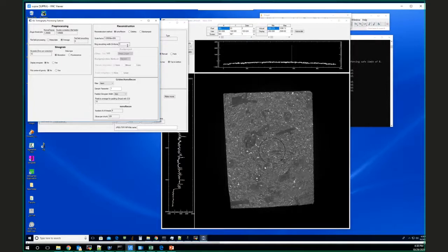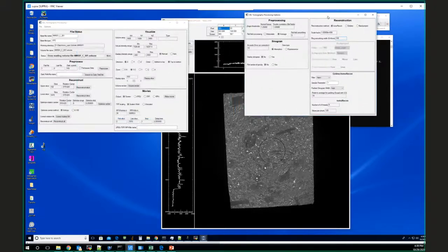So then I smooth that averaged sinogram and say anything that's deviating from that smooth version is causing a ring artifact. The thing you can control is how big that smoothing is. The default that I use is 9 pixels. For minor ring artifacts, like we get in monobeam, usually that's enough to fix it up pretty nicely. But that did not get rid of this ring. So let's do instead 100, a much bigger smoothing kernel, and then reconstruct that slice again.